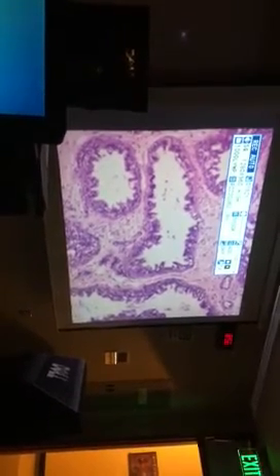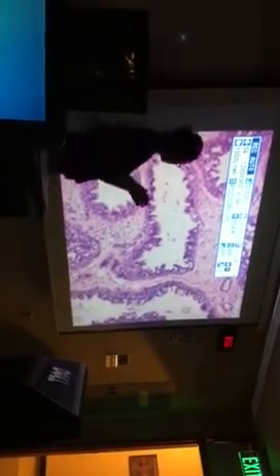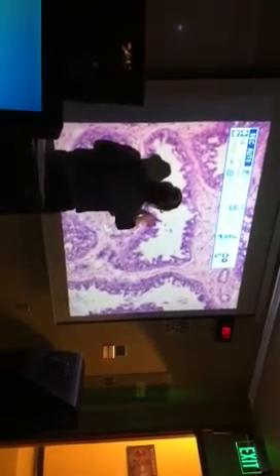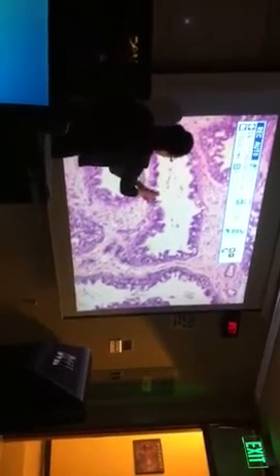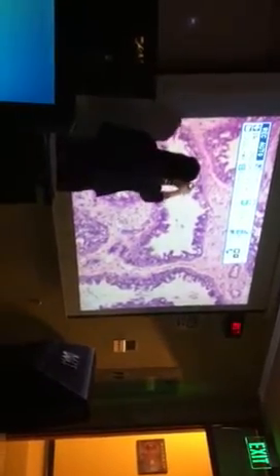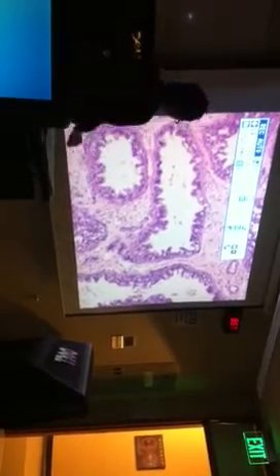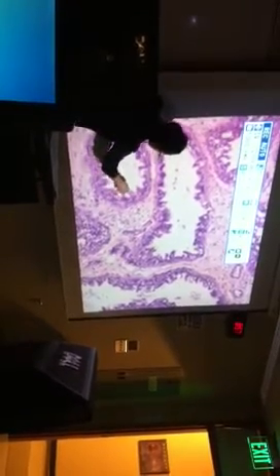And again, it's a little bit hard to see projecting it like this. You can see the microvilli better if you take the fine focus and go forward just a little bit and back just a little bit. But you can see it looks kind of ratty, with these things sticking up. That's the microvilli of the cells lining these tubules. So all of those little frayed areas, those are the microvilli. And again, what's inside here are the sperm cells. You can see that's a long microvilli. There's some microvilli.